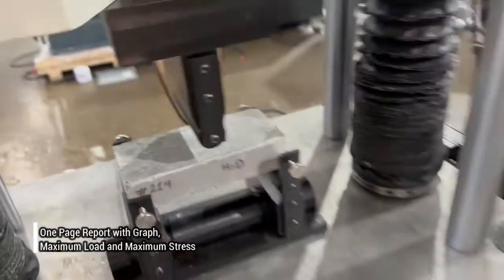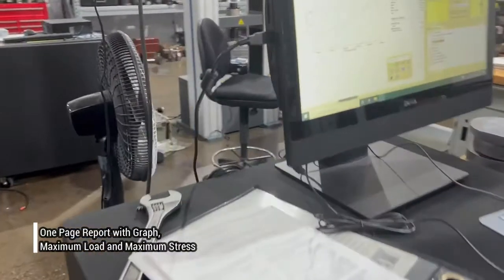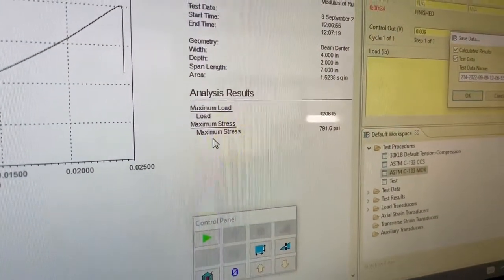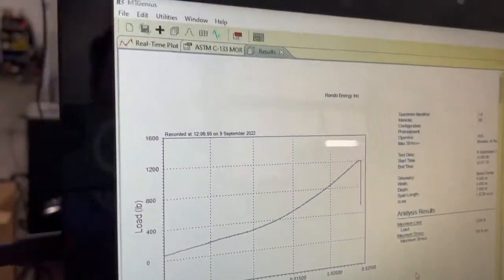We got a one-page test report showing all our results, which a maximum load of 1206 and a maximum stress of 791.6 PSI.